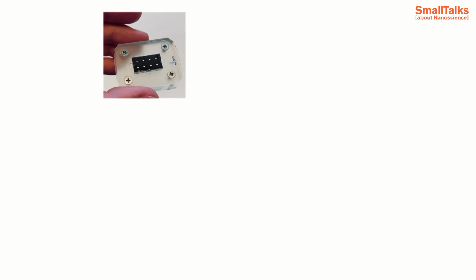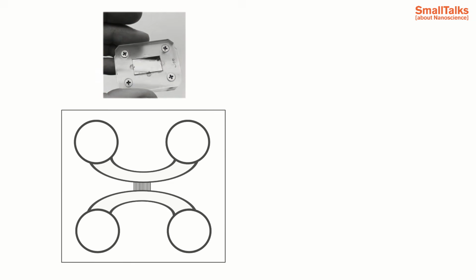Single molecule nanofluidics is the main method we use in our group. It is based on stretching the DNA in nanochannels due to confinement. To stretch DNA, we utilize a custom-made nanofluidic device that you can see in the video. Two of the devices are set on the same chip, and if we look closer at one of them, we can see that it consists of 4 wells.